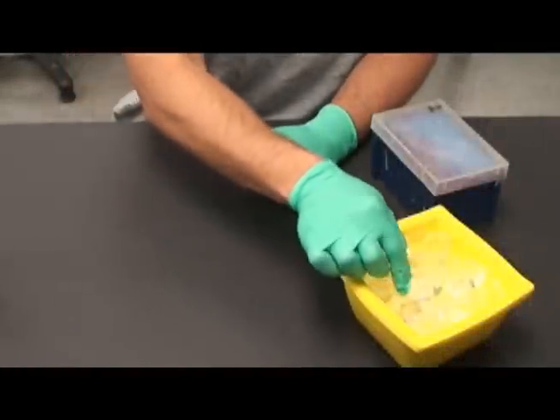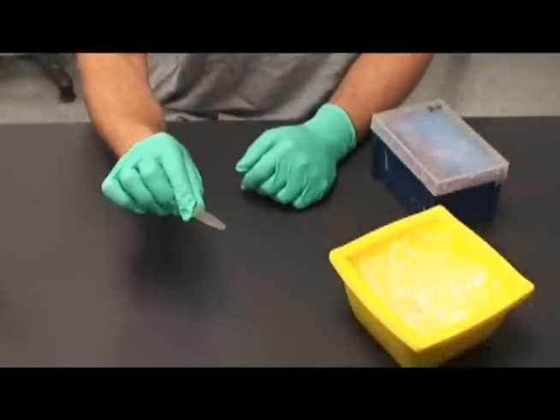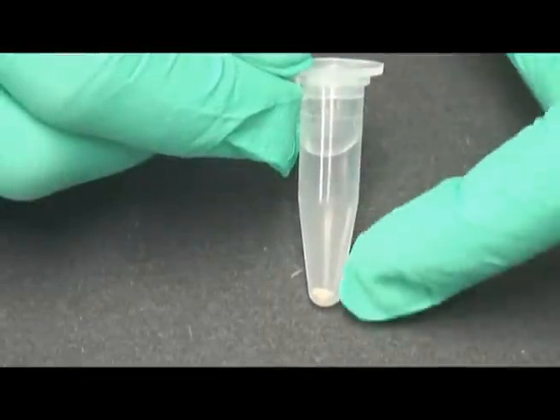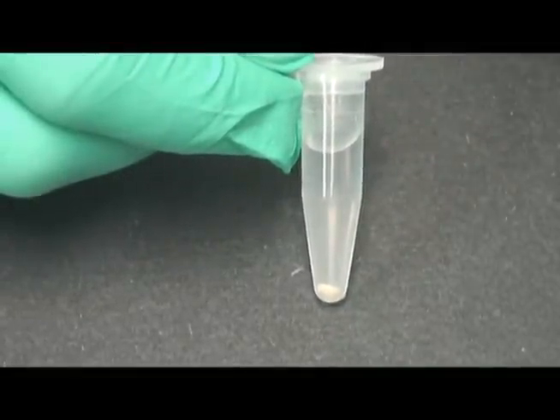Centrifuging this tube for 2 minutes will pellet the cells to the bottom of the tube. Following centrifugation, the cells are seen as a pellet at the bottom of the tube.